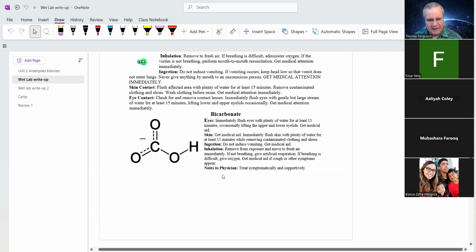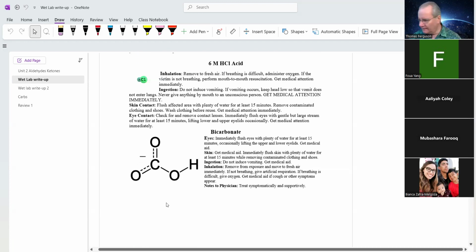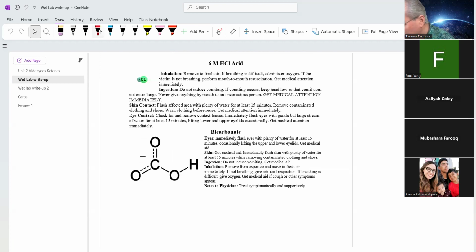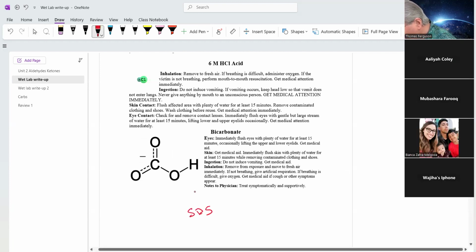Remember, the first aid can be had from the SDS document, section 4. So for example, you would go on this one here, you'd go to Google and you do a search. And you're going to end up with a PDF file.